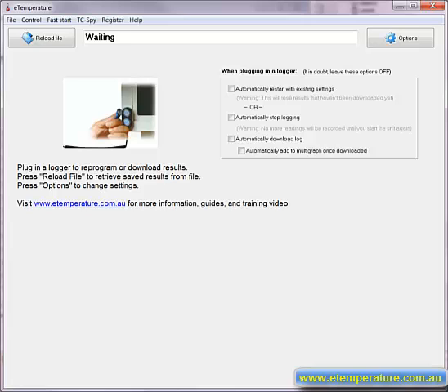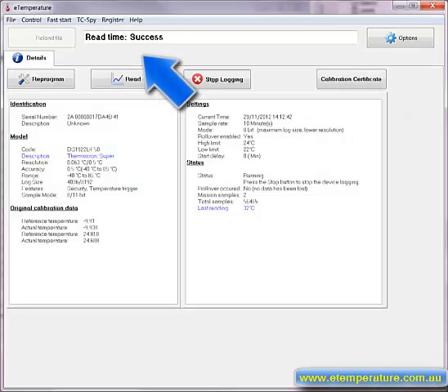When eTemperature is running, you will see the message waiting at the top. When you plug a thermocron into the reader, you will see the message change from waiting to read time success.